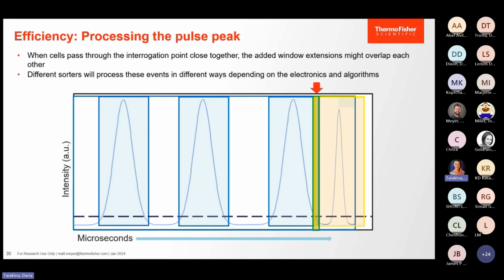Bigfoot has the ability to change the window based on the dynamic algorithm that it uses. On some instruments, there's a fixed time period, and that is something you can change, but you can't change it dynamically. Bigfoot will actually change that dynamically.